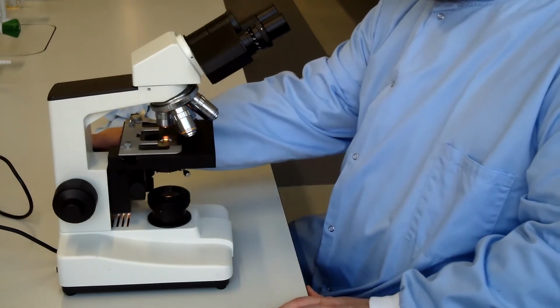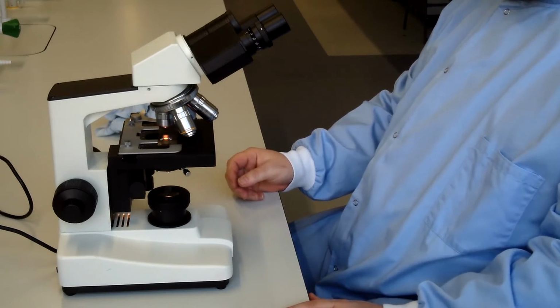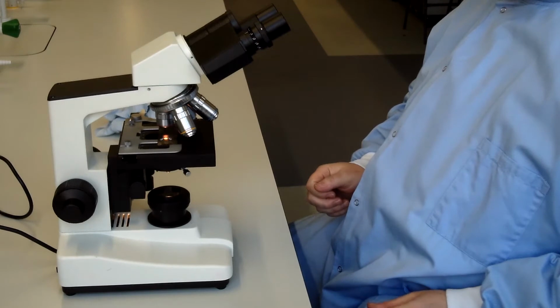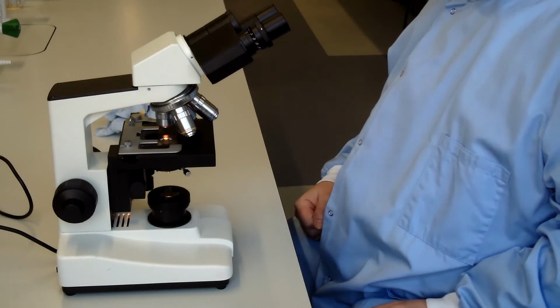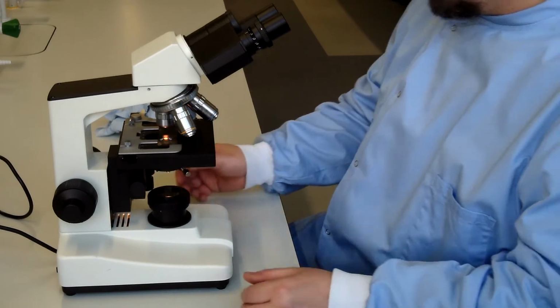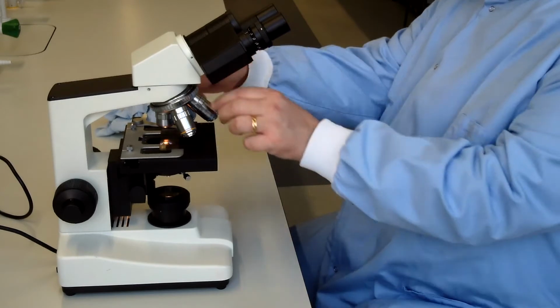At this magnification, what we're really looking to find is an area of our slide that doesn't have too much heavy staining on it, so quite lightly stained, as this gives us the best chance of being able to see individual bacteria at a higher magnification, which will allow us to see not only what colour they're stained but what their shape is. So looking down the eyepiece, we can focus on our slide, and when we're happy with the area that we found, we can move to higher magnification.